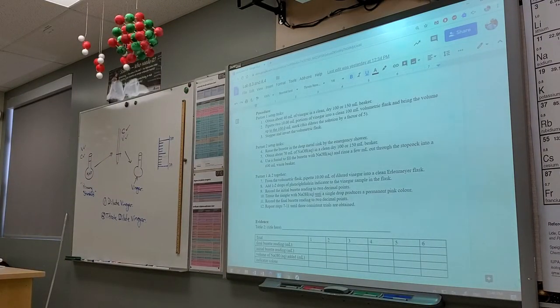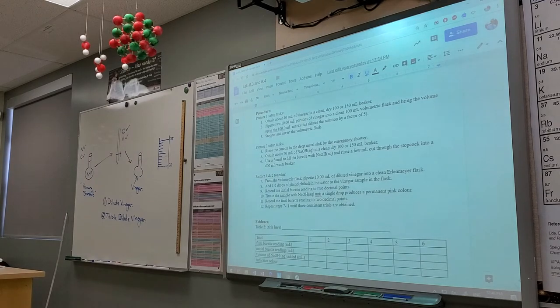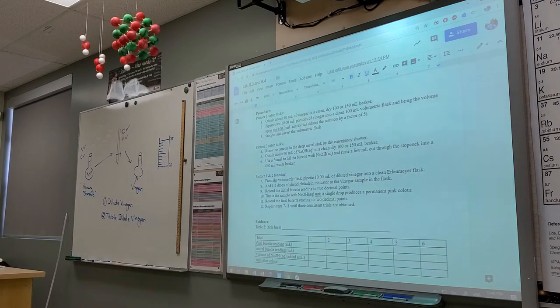What I want to be very clear on is how we clean our burette. What's eventually going to go in here? Sodium hydroxide. What are you going to rinse the burette with? Sodium hydroxide. That's the whole point.